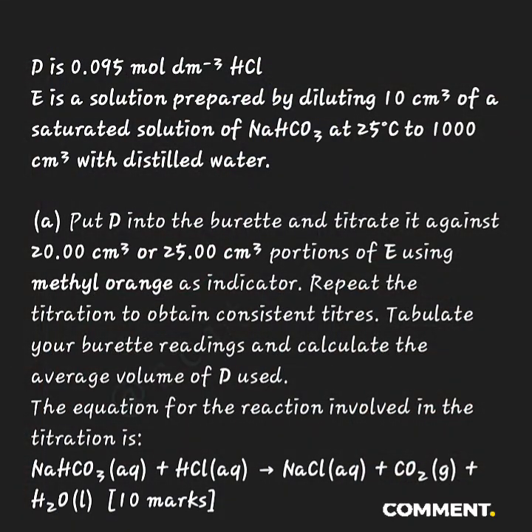We're going to use a sample question, a WAEC sample question. And you may see it like this in your exam hall. But whatever you will see would dance to this tune. Okay? The values may change, but the structure will look like this. Let's go.